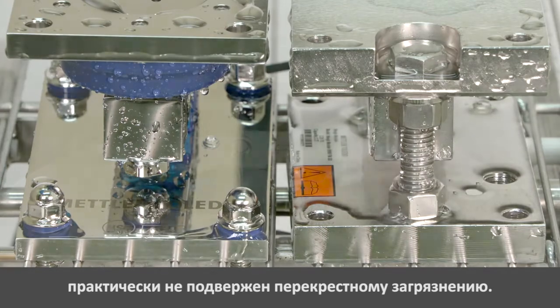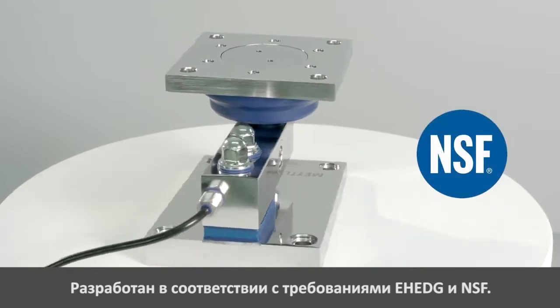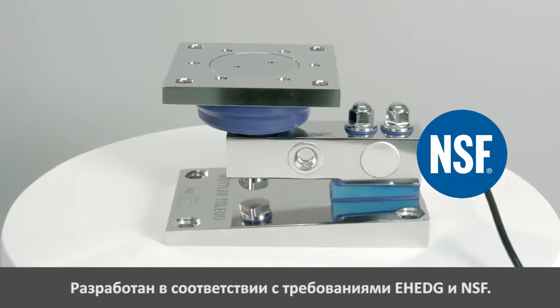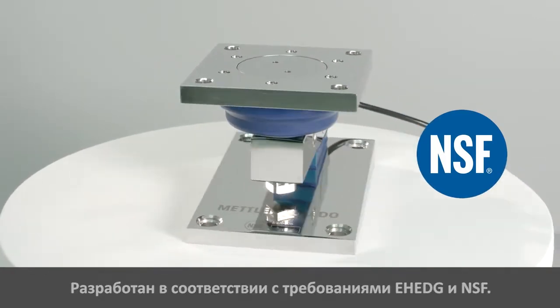In the following minute, we show you how. Mettler Toledo has designed the new whey module according to EHEDG guidelines from the European Hygienic Engineering and Design Group, and the NSF, which is the National Sanitation Foundation.